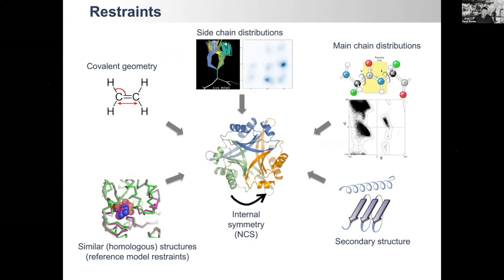So that's exactly why we need to bring this extra information, which are chemical and generally geometrical restraints. And there's a whole bunch of different sources of this information that can come into refinement. A very basic one that we always use in macromolecular crystallography is restraints on covalent geometry, which enforces particular bond lengths and angles and the fact that some groups may be planar and so on.